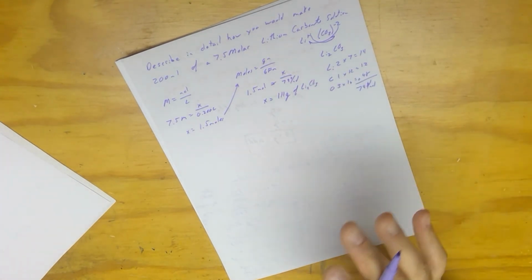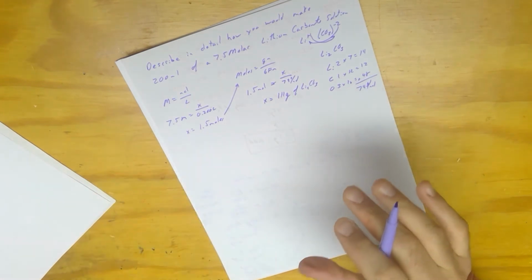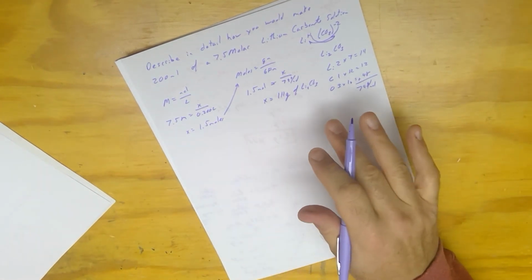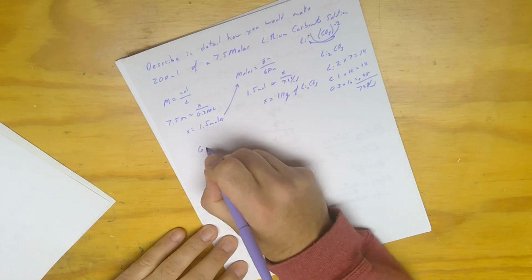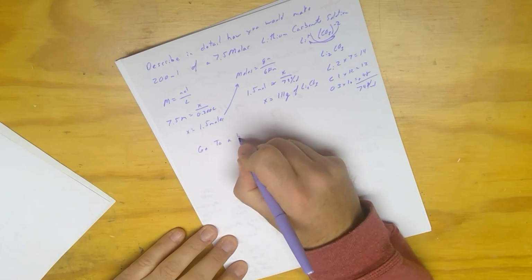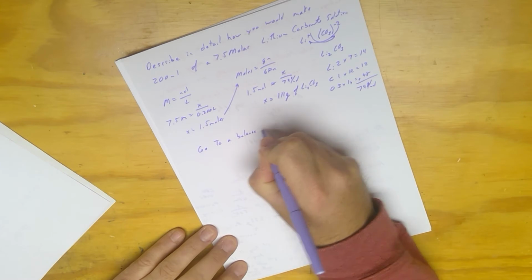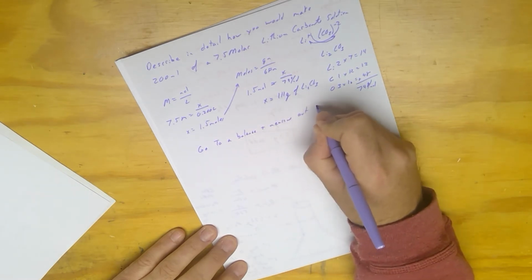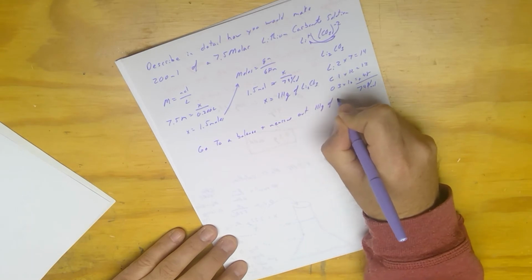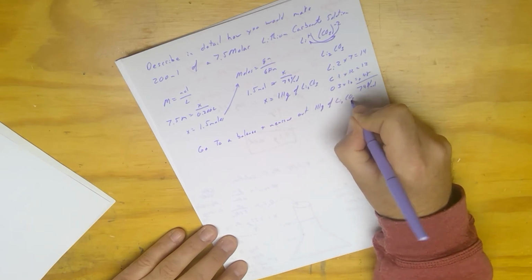All right, so now, this was a regions question, so you had to be specific on how to make it. So now what you would say is go to a balance and measure out 111 grams of Li2CO3.